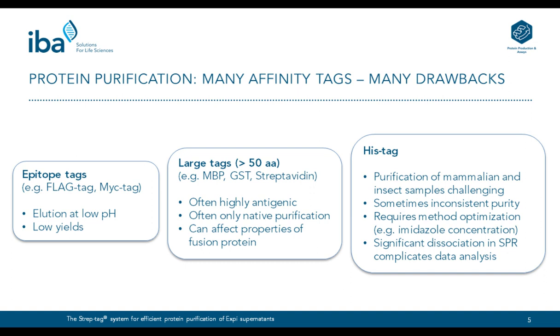And this makes purification, especially of larger amounts of protein, expensive if you use these tag systems. Another group of tags are large tags like the maltose binding protein or the GST tag or the streptavidin tag. These tags can increase the solubility of your protein of interest or its expression, but on the other side, these tags can also influence the properties of your protein of interest, leading to a different behavior in your further experiments. And that's something, of course, you would like to avoid.